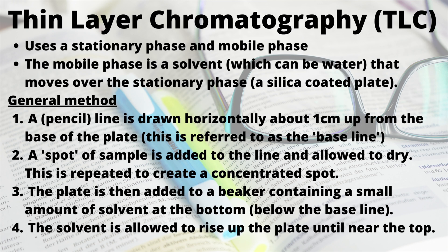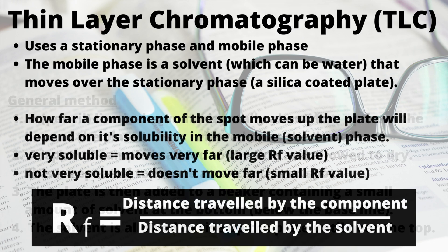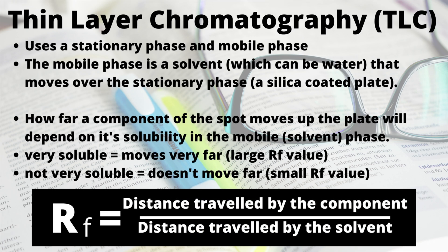The plate is then added to a beaker with a small amount of solvent at the bottom, which must not cross the baseline. The solvent will then start to rise up and naturally cross the baseline as it moves across the TLC plate. You will then see the different components of the mixture start to separate out and travel up the plate. We allow the solvent to get close to the top but not leave the plate — we call this point the solvent front. The finished plate is referred to as the chromatogram.